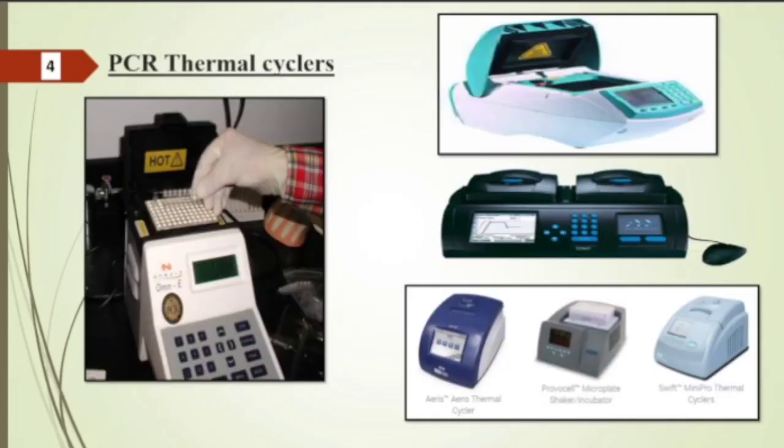These are the PCR machines, PCR thermal cyclers. Different PCR thermal cyclers are used in different methods of PCR techniques. There are so many types of PCRs. We will discuss the types later. These are the different PCR machines. All are used in different types of PCRs.